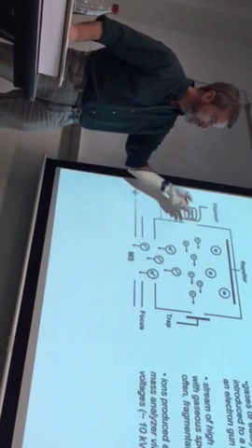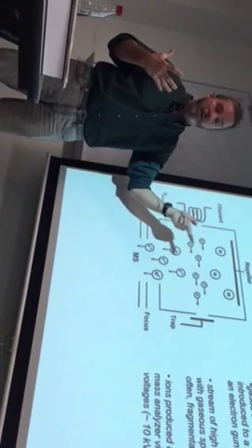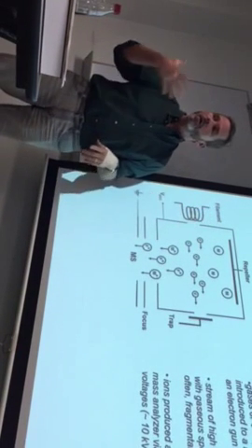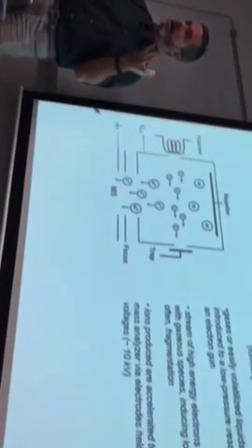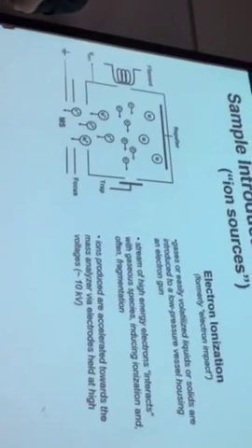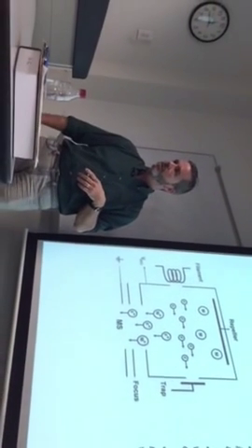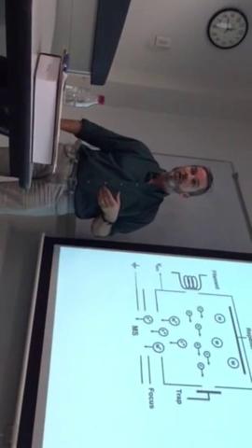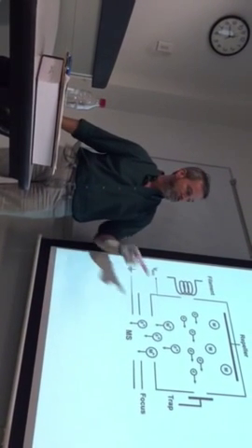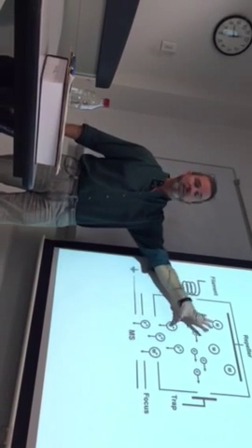Also, depending on the nature of the molecule and the energy of the electron beam, it could be that more energy is transferred, not just enough to strip off a valence shell electron and form that molecular cation, but enough energy is transferred to actually rupture one or more chemical bonds, right? Breaking bonds in the molecules, yielding what we call fragments in mass spectrometry, symbolized by the F here. Those fragments likewise possess a positive charge, very often monovalent, usually just the 1+ charge. Everybody good on the production of ions now?